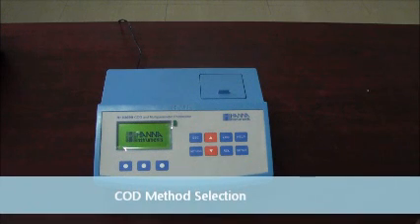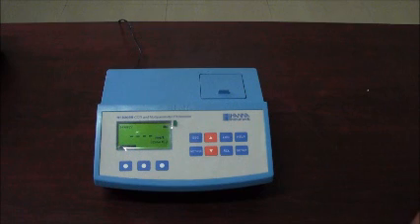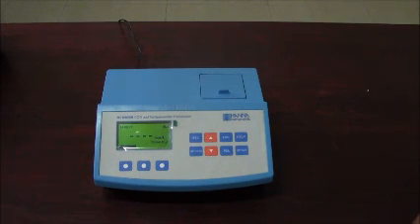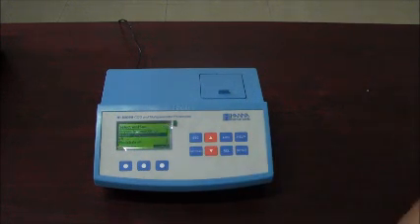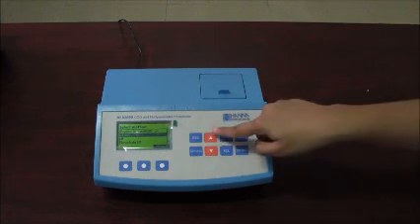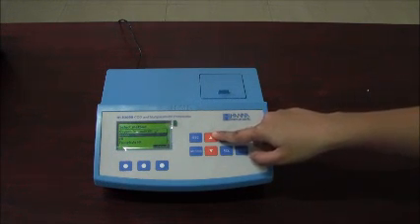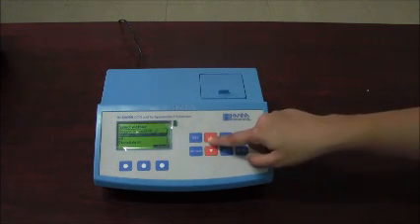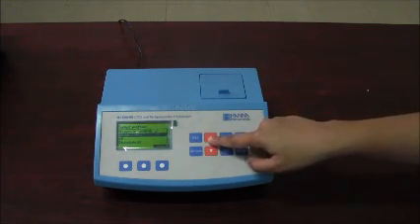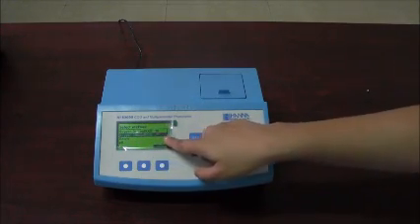Turn on the meter using the on/off button. The meter will undergo a self-initialization test. The meter defaultly displays the screen of the previous measurement mode. In order to select the desired method, press the Method key. The screen will display all the available methods. Use the up and down arrow keys to select the desired method. For example, in this case we have to select COD LR range, so use the up arrow key to select Chemical Oxygen Demand COD LR.